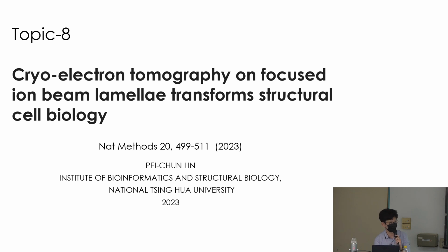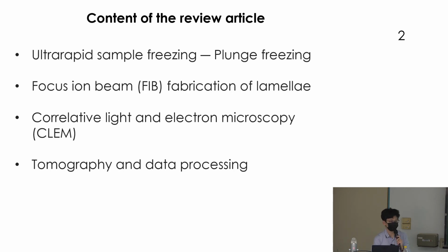Cryo-electron tomography is a very popular technique now. It was used for the structural study of macromolecular complexes as well as cellular structure, particularly in their native environment. The paper I give you is actually a review article. It will particularly focus on how you prepare a sample for cryo-electron tomography, or cryo-ET.